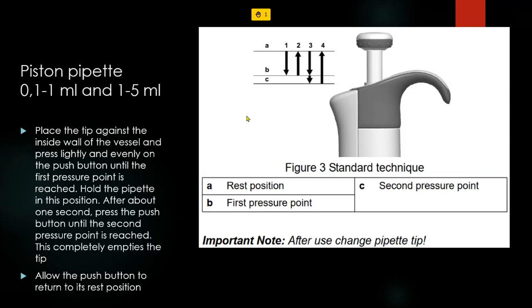Sir, what is the range of testing in ammonia, wavelength 420 or more, in the test of ammonia? Listen, what are they saying?